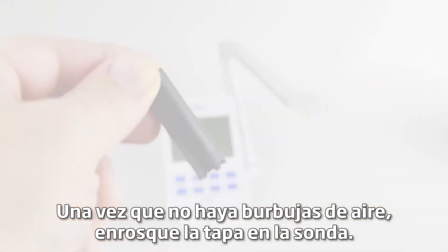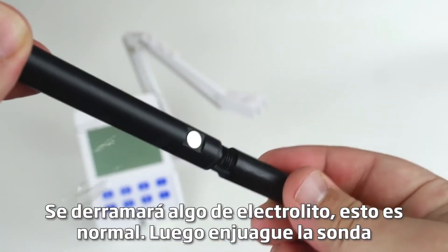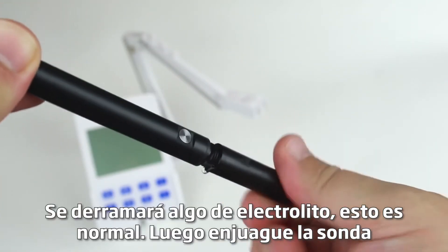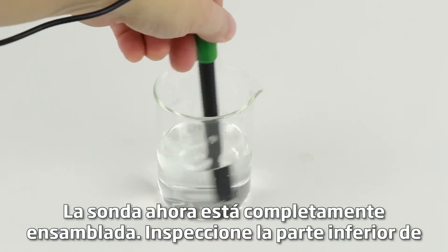Once there are no air bubbles, screw the cap onto the probe. Some electrolyte will spill out — this is normal. Then rinse the probe after filling. The probe is now fully assembled.